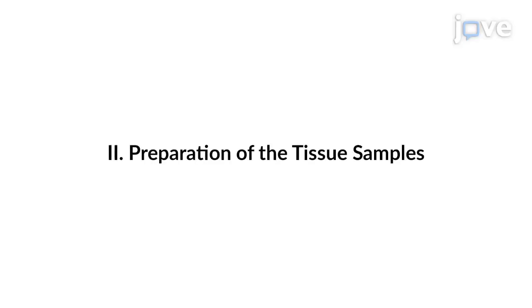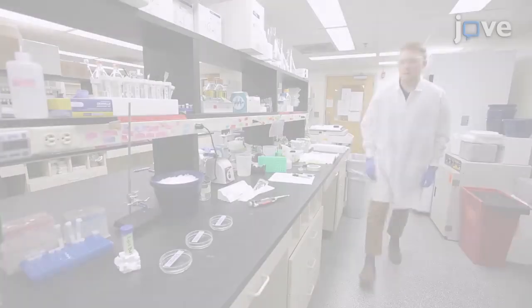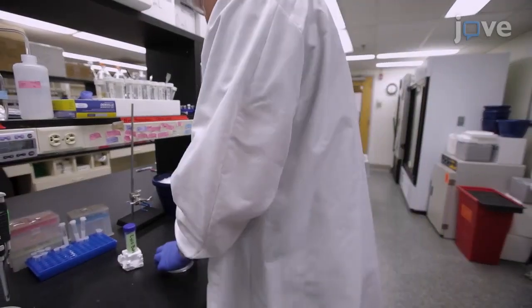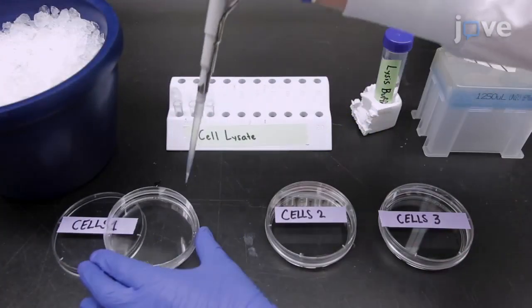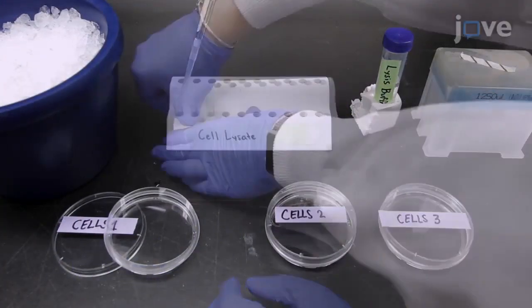Demonstrating the procedure will be John Chynowski, a graduate student from my laboratory. To begin, mechanically lyse the tissue sample or cultured cells as outlined in the text protocol to collect a total of 900 microliters of sample.